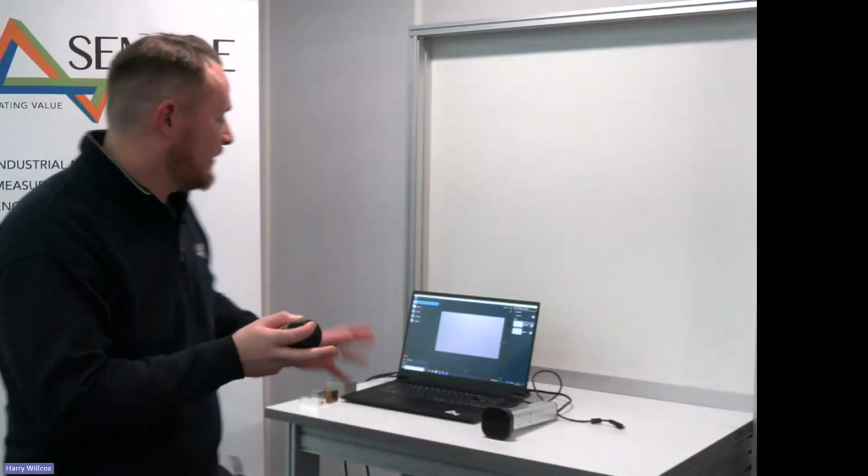We've got two different Gelsight systems here that we're going to be running through today. The main premise of what we're trying to give you is an overview of some of the new features in the software and the capability of the system itself. We've pre-recorded a couple of the functions. I think there's five of them we're going to run through. They're 2-minute snippets that roll for about a 10-minute period.